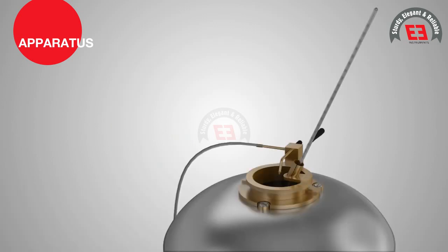In Open Cup Tester, the cover of the cup is replaced by a clip which encircles the upper rim of the cup and provides for test flame and suitable thermometer.